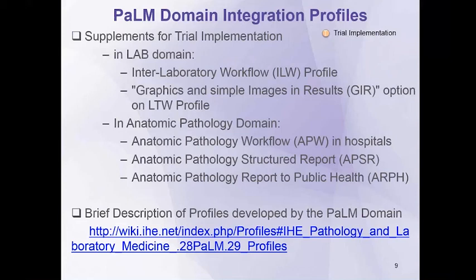And then we have some supplements for trial implementation. In the lab domain, it's the interlaboratory workflow. That's when you're sending your lab tests out to another laboratory for reference testing. And then the graphics and simple images and result options, that's part of the laboratory testing workflow profile.